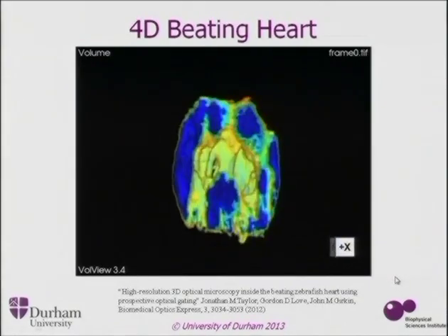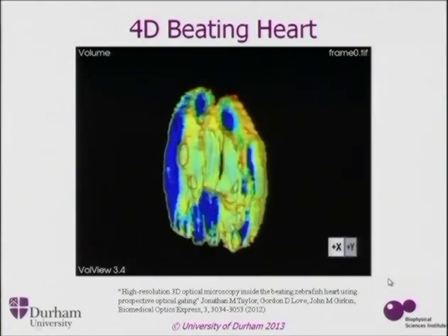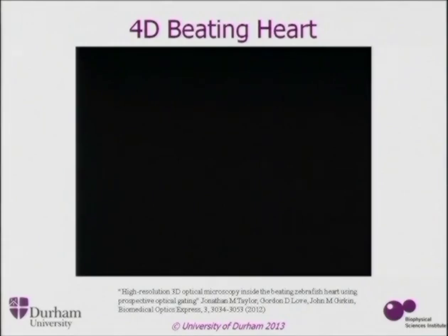So this is taken from a live sample, and we can do this now with about 2 micron resolution. This has been reconstructed to smooth it all out, but we can actually watch and track where each individual cell moves within the heart. So this has given us the ability to build up these four-dimensional images. And as I said, this is in a zebrafish, which seems to be becoming a very, very standard model now in a number of different biological areas.